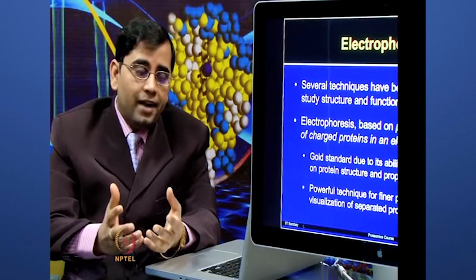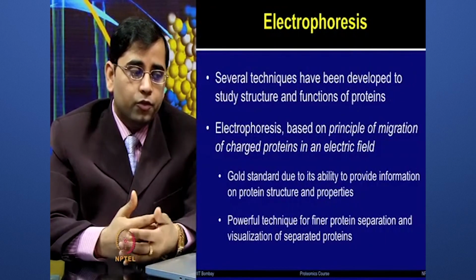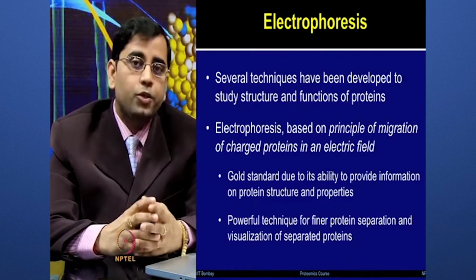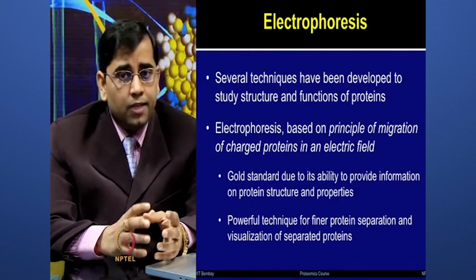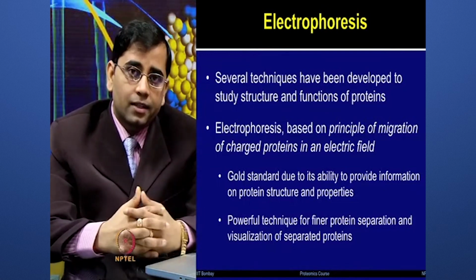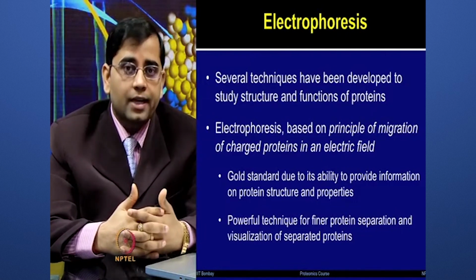The gold standard status of SDS-PAGE and different types of electrophoretic methods is because they have the ability to provide information on protein structure and properties. This is one of the very powerful techniques to separate proteins and visualize the separated proteins by applying different types of staining methods.